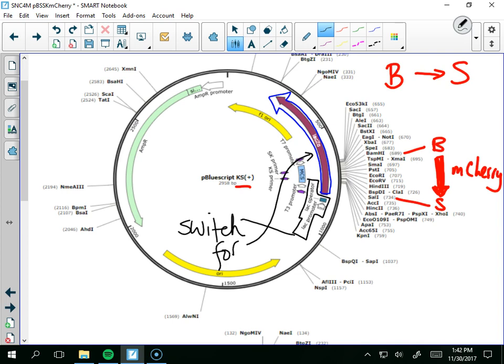Okay? So if I put that in, it would make that protein, but it'd be the reverse. I'd be actually making the antisense backwards, which would not get me a glowy protein. It would get me something else entirely. It'd be useless to me. Okay? So are we using KS? Ew, KS is out.